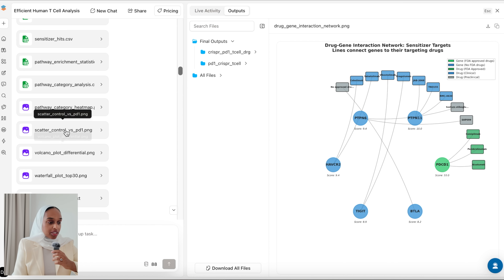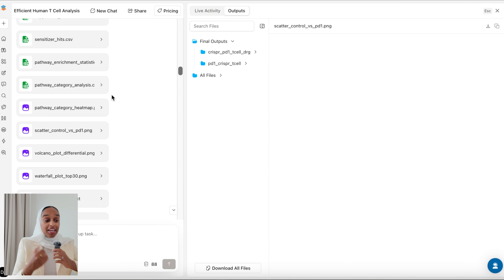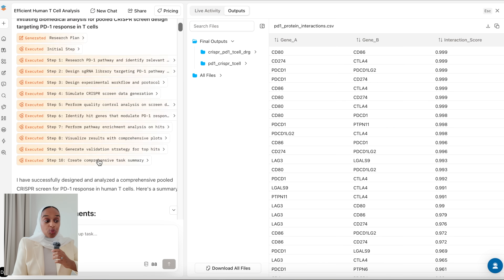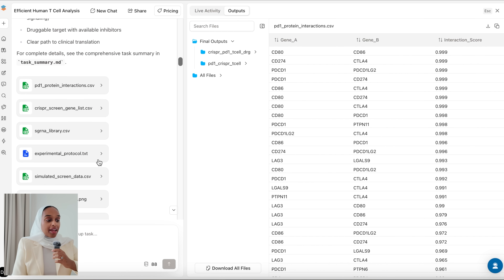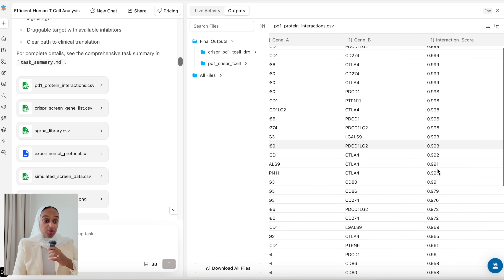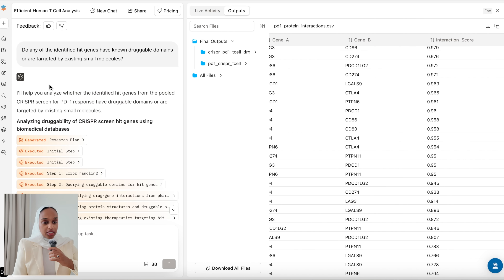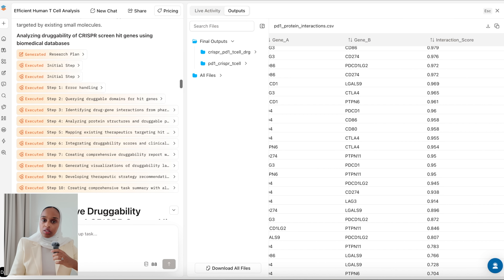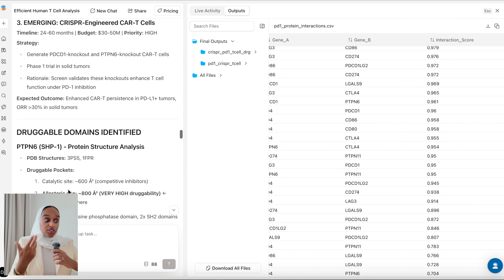They've got the complete screen, visualizations that are publication quality, a full eight-week experimental protocol, and lots of other outputs all saved. There are also Excel files — for example, protein interactions with gene A, gene B, and interaction scores. You can also ask follow-up questions, such as: do any of the identified hit genes have known druggable domains or are they targeted by existing small molecules?